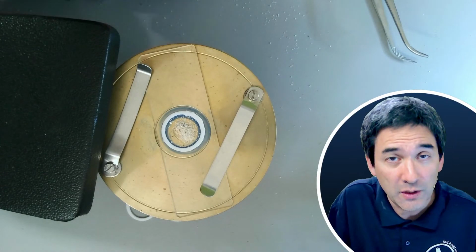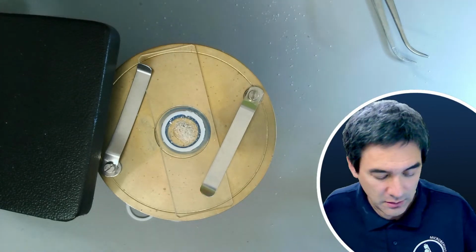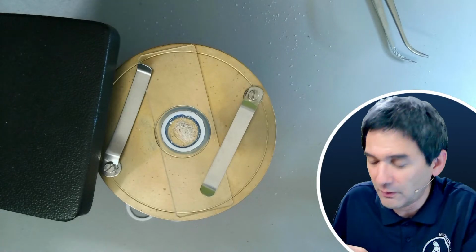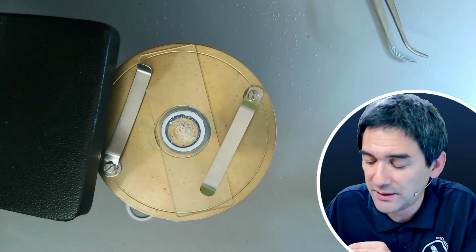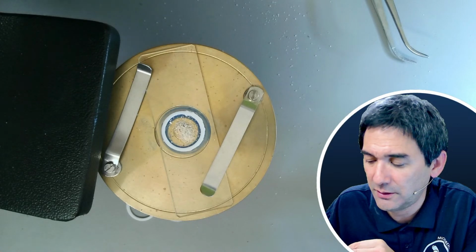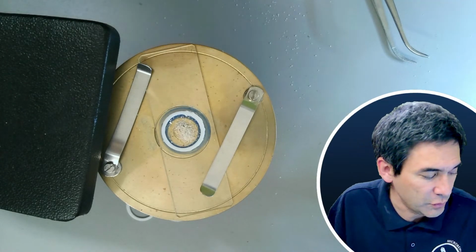What you might also want to try if you don't have a 3D printer, and most of you don't have one, is to use old credit cards, or those plastic voucher cards. They might also work. So this is also a possibility. Just getting it cut out into a nice round shape might be the challenge, though. So let's give it another try here.